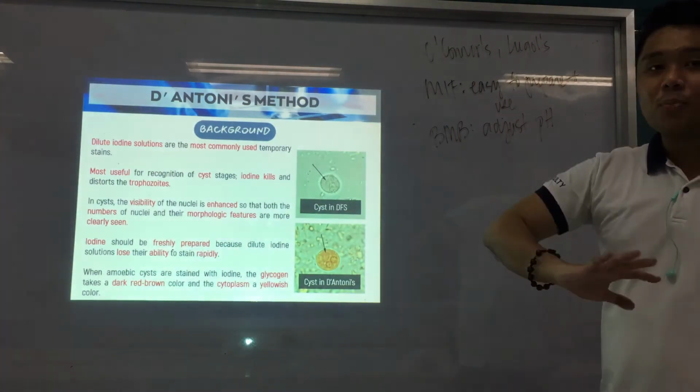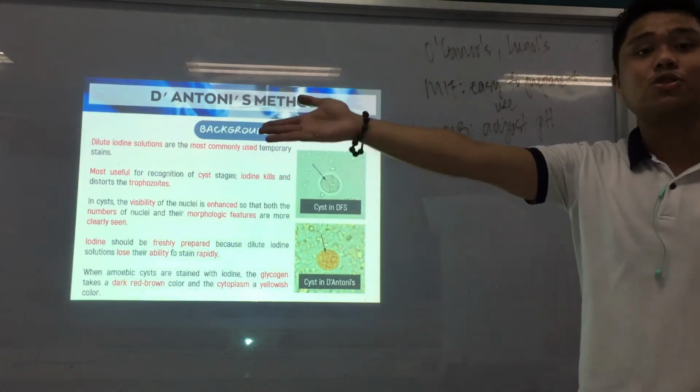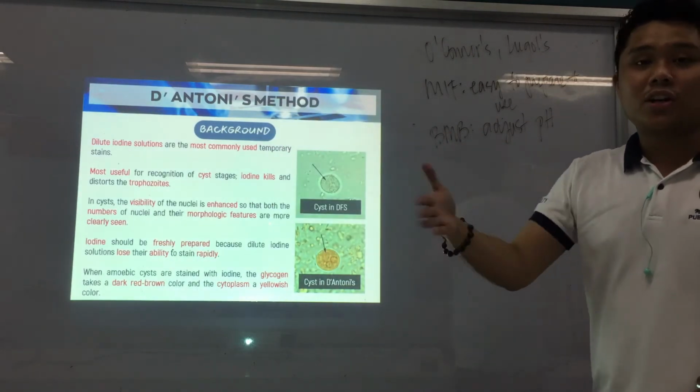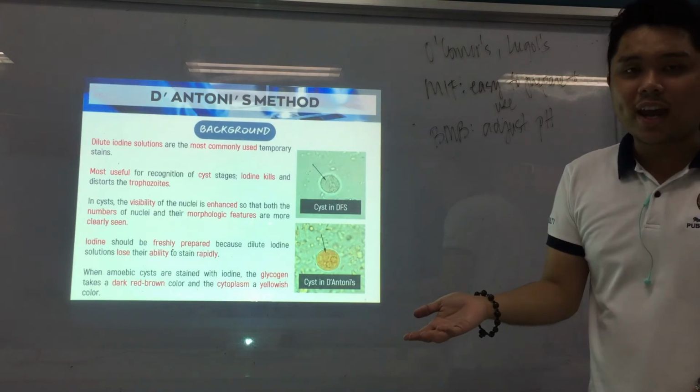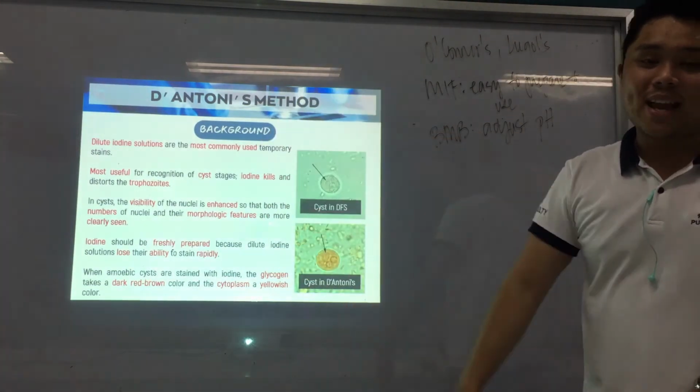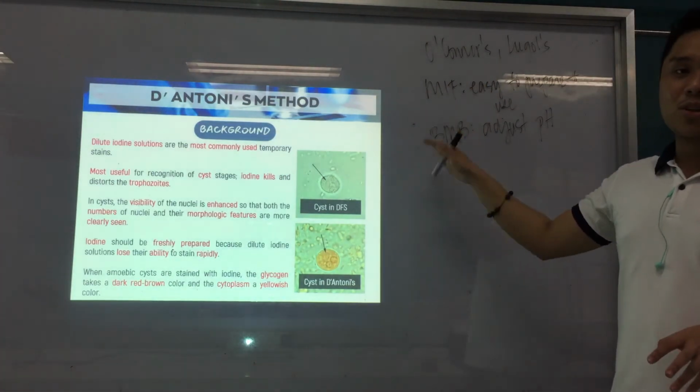So if you want to preserve the smear for the long run so that you can see it again in the future, then we use other stains, other colors. That's another topic, another lecture in the later part of the semester. Again, these are temporary.